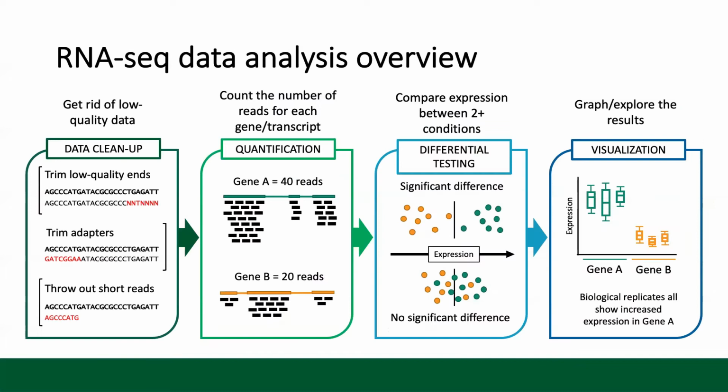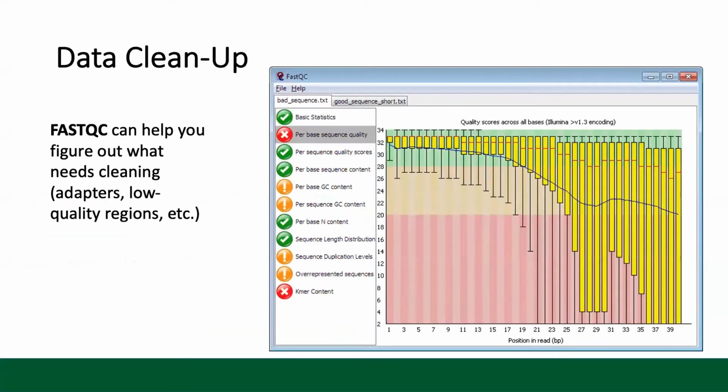So I am going to walk through the quantification and differential testing and visualization part of this in real time, but data cleanup would just take too long. These trimming programs take a really long time to run. So I'm just going to explain that in a little bit of detail here first.